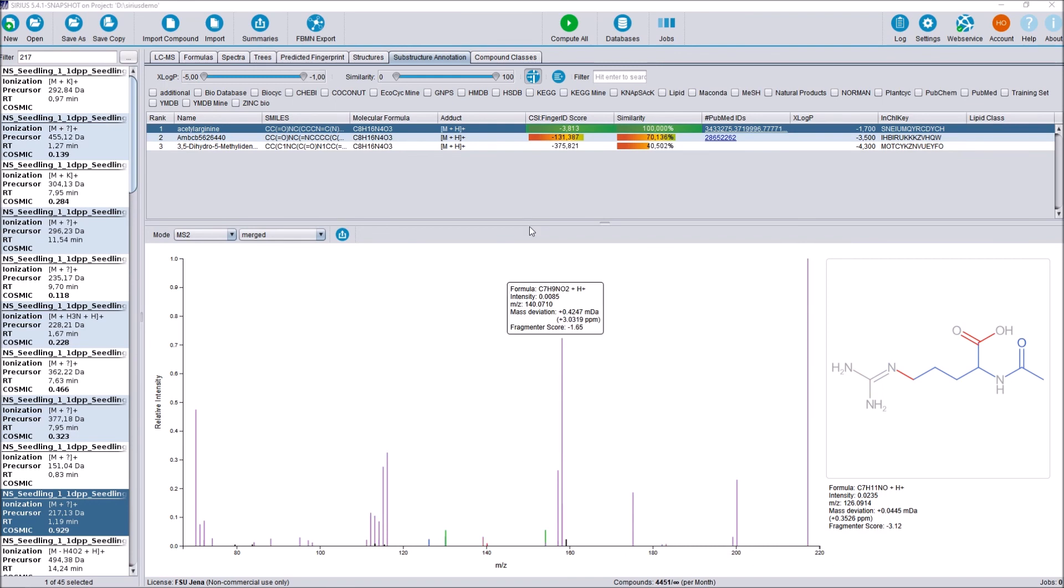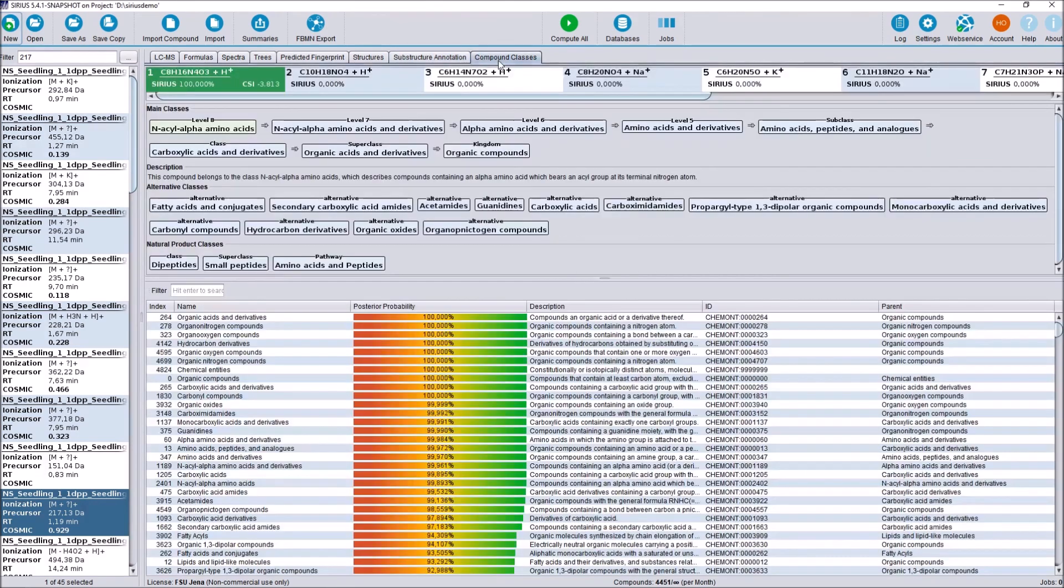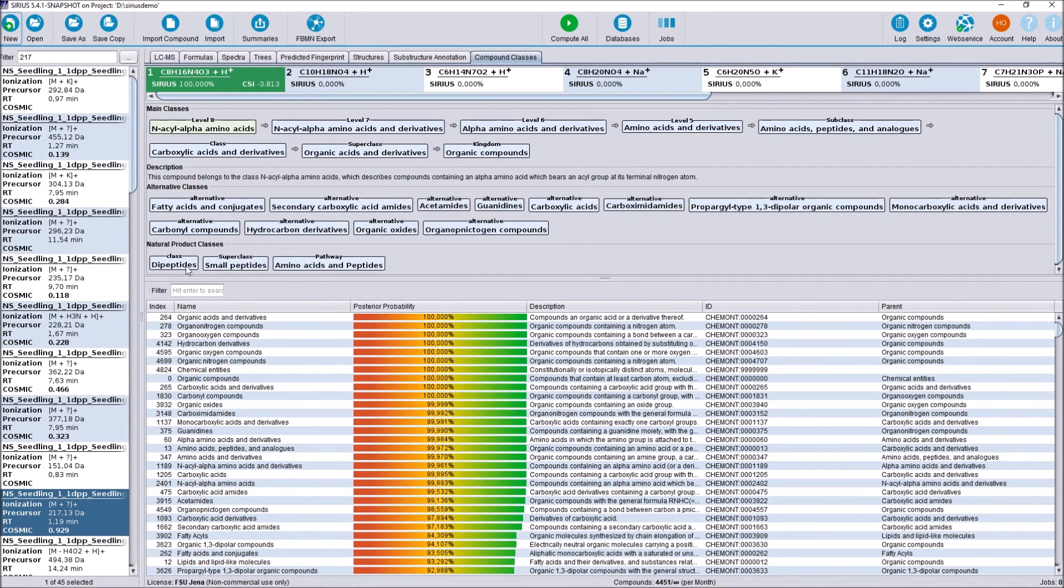Last but not least, we have the compound class prediction by CANOPUS up here, which now also includes the natural product classes, including class, superclass, and pathways, if available.